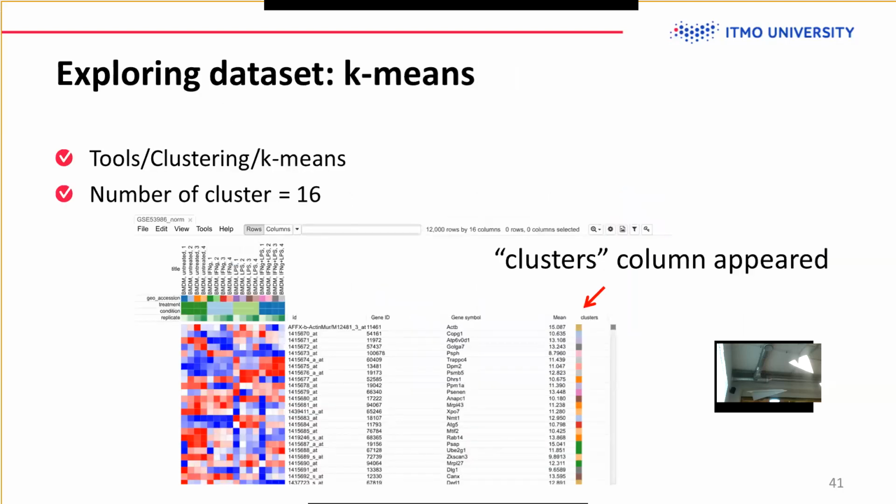Okay, so this is about PCA. Another common way to look at the data is to do clustering, in particular gene clustering. Here we don't have too many samples, so we won't talk about sample clustering, or actually, we'll talk about it in some different sense.